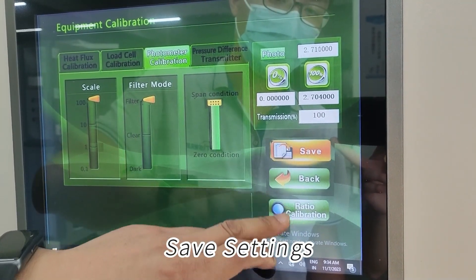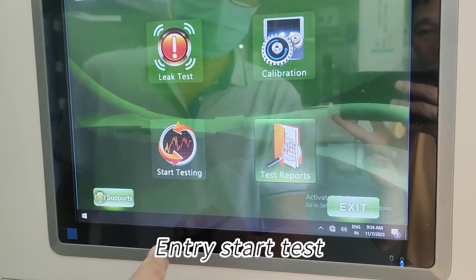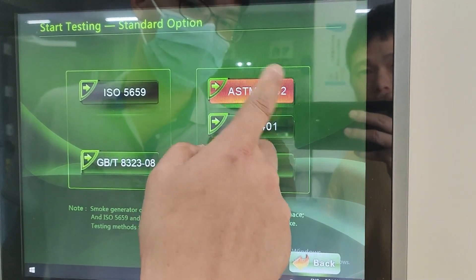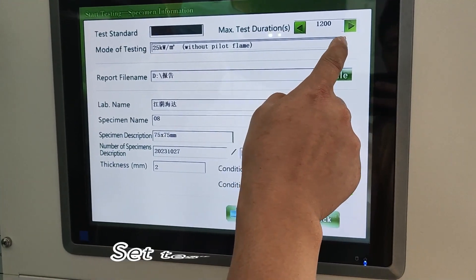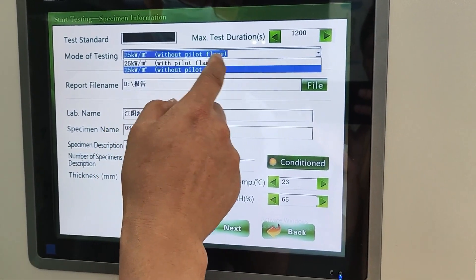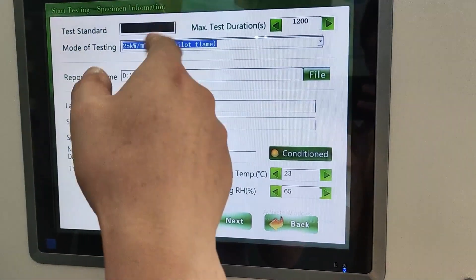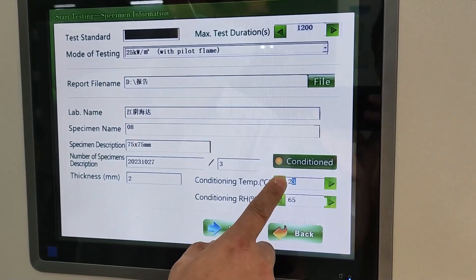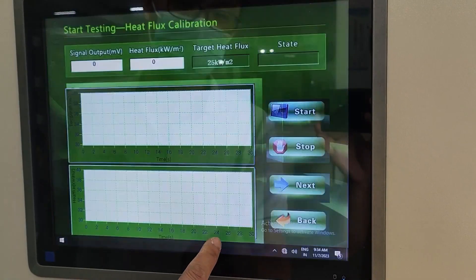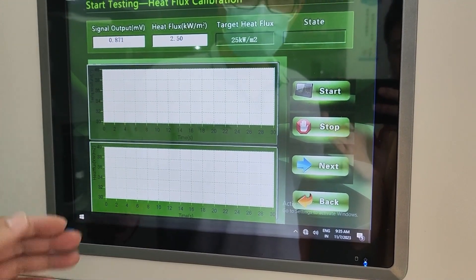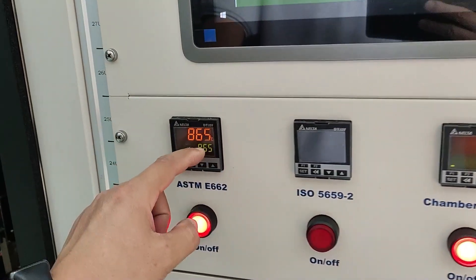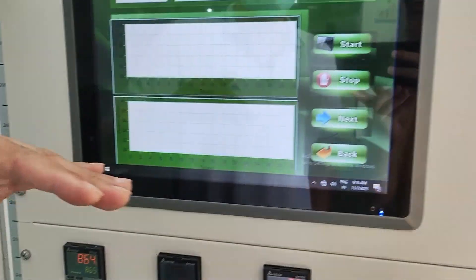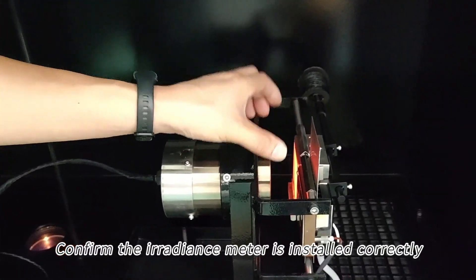Save settings. Enter start test. Select test method. Set test information. Confirm the temperature of the irradiation furnace. Confirm the irradiance meter is installed correctly.